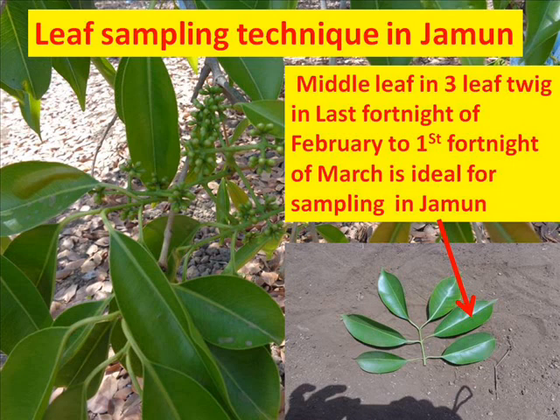We digested the samples and observed different months, from flowering stage to fruit maturity stage. We calculated the nutrient concentration after digestion and analysis of the leaves.